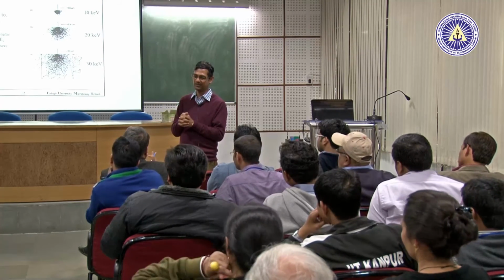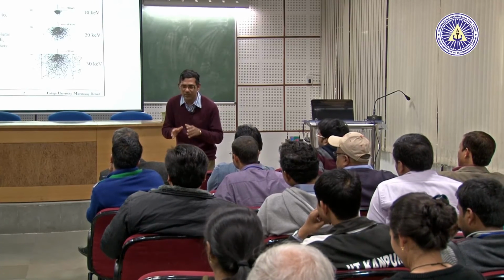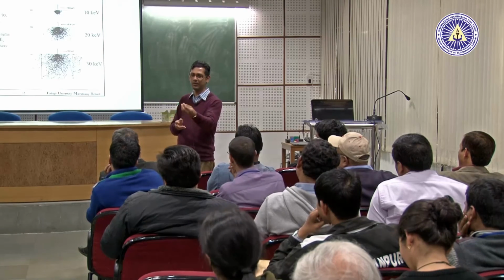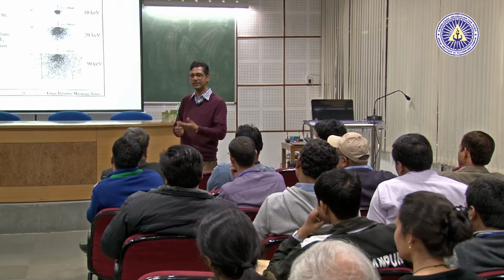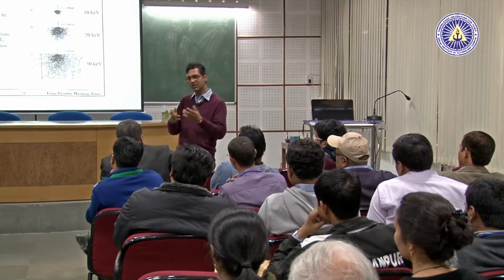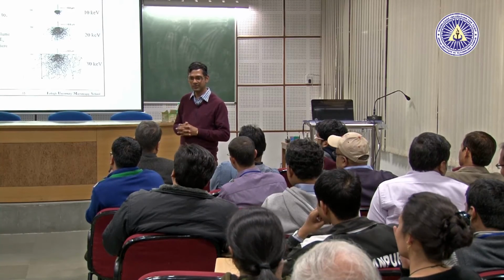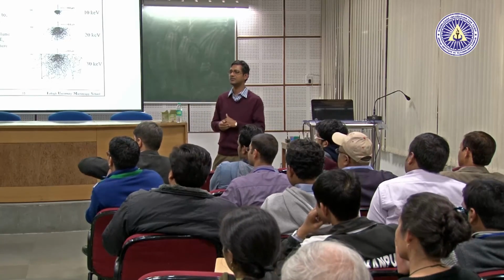In the case of EDS, can we detect the molecule? You mean the composition of the molecule? Yes, why not? You can detect the composition of a molecule. If you have a sample with a particular chemistry, you can detect its exact composition, for a single phase material. Suppose polyethylene is present, it will tell you the composition of carbon, hydrogen and other things. Then you can detect the exact composition and a formula can be obtained. It's possible.